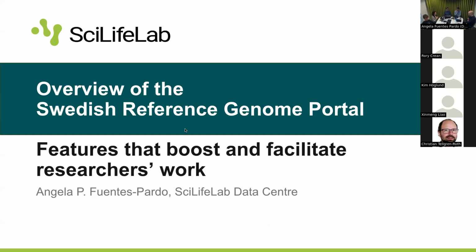I hope you are all motivated and identify some key features that could be useful in your work. Now I'm going to talk a little bit about things that we identified that could definitely be helpful for researchers to boost the way of work and facilitate, in general, how to share and communicate data.